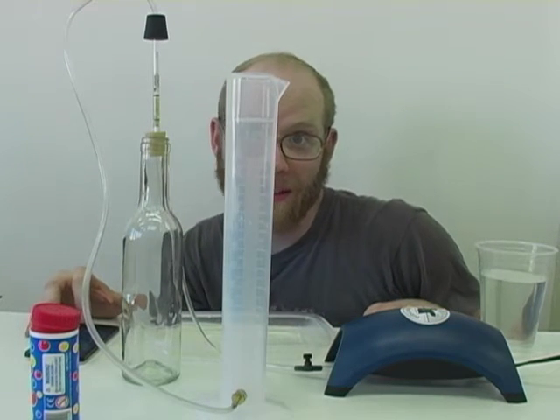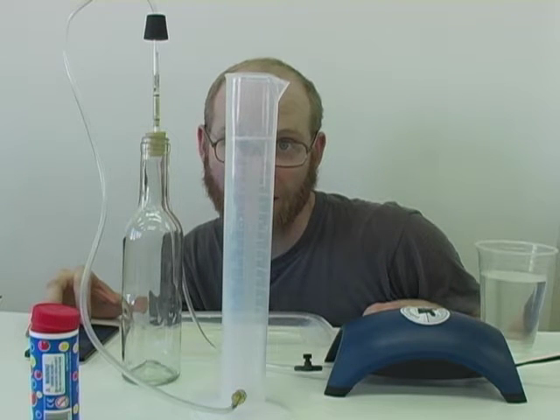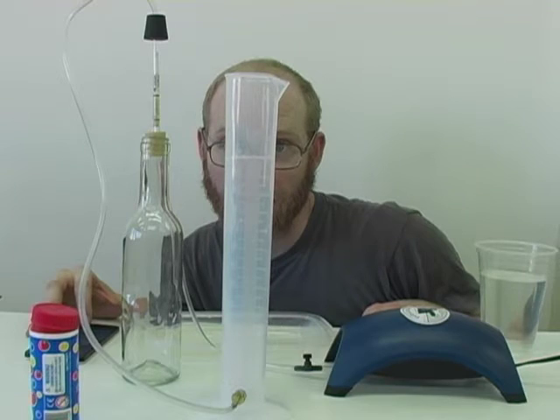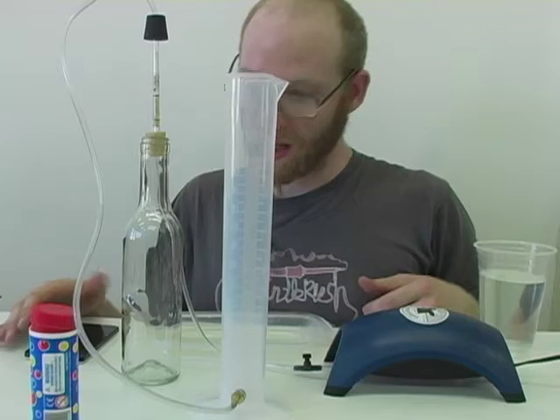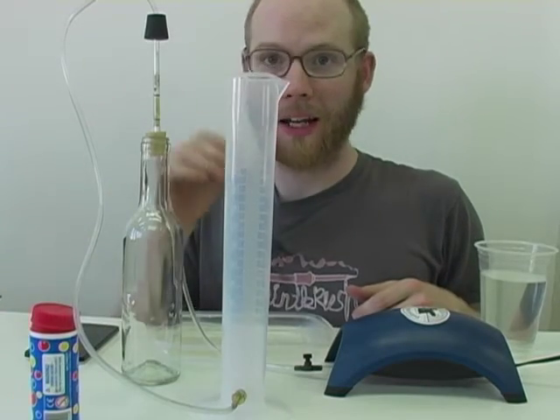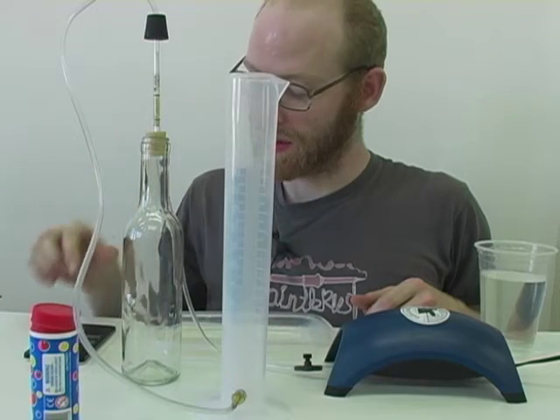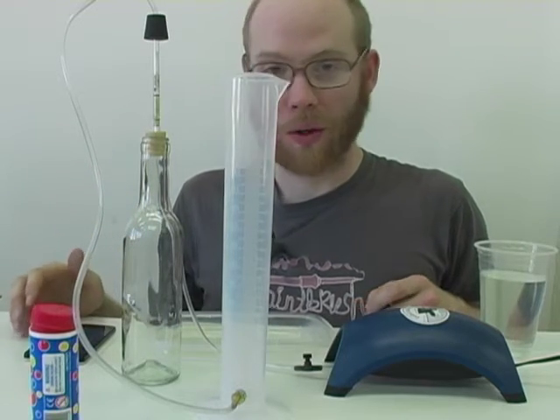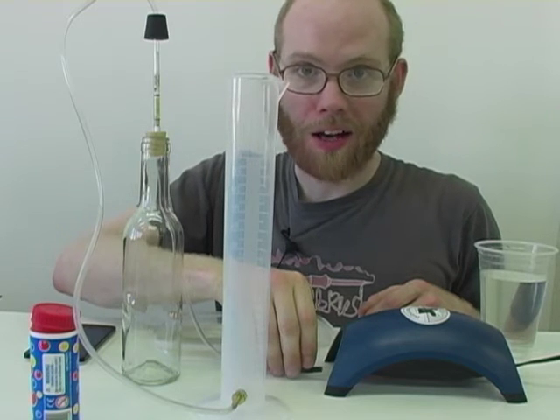I'm going to wait until it hits 250 and start my stopwatch. Our first reading was 38 seconds which is a little bit less time than the 40 seconds we're looking for. So I'm going to dial the valve down a little bit.